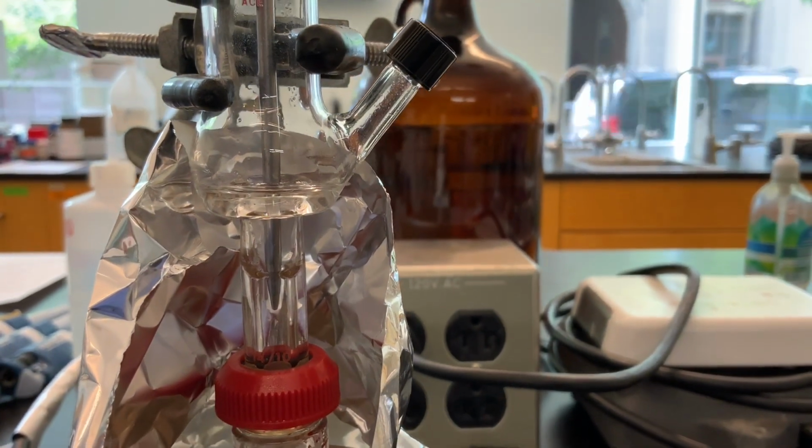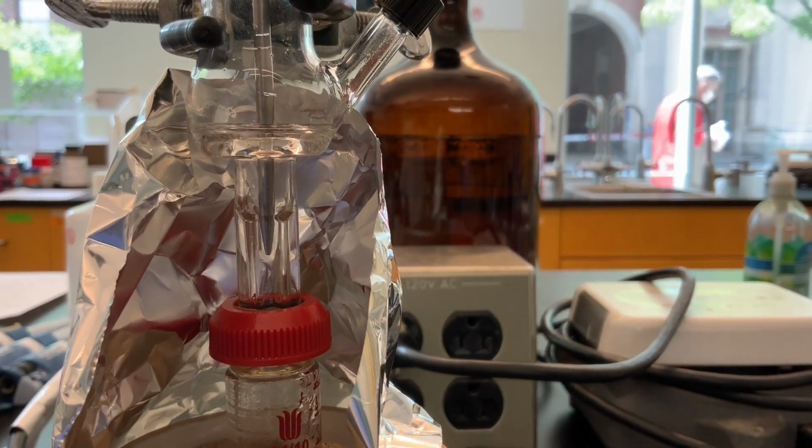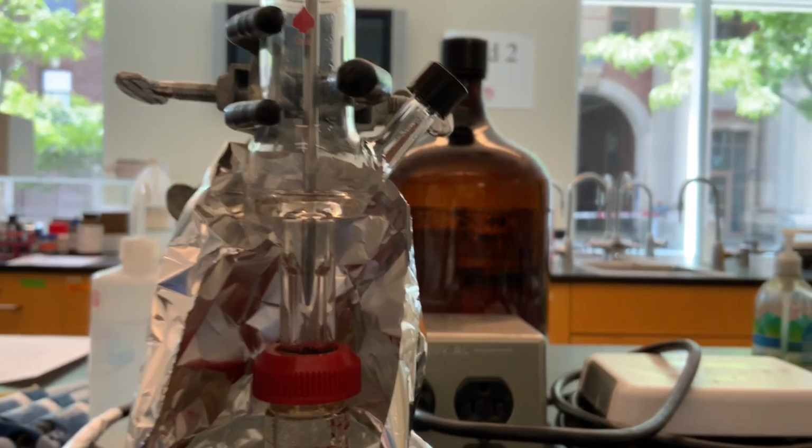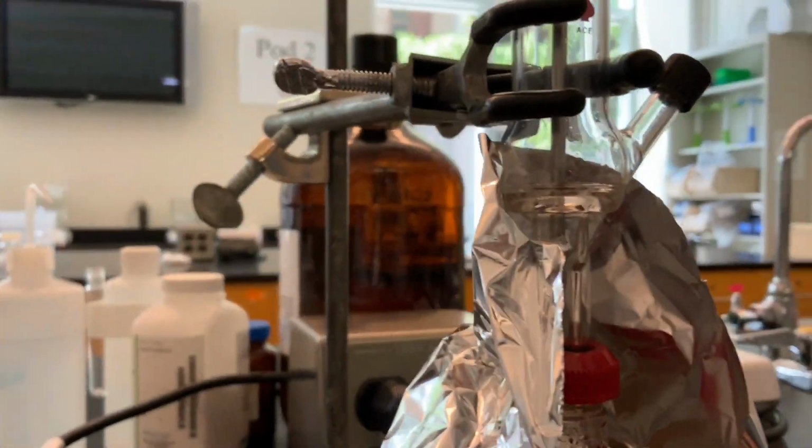Alright, so this is good enough. We don't need to distill to dryness. So this is going to be our fraction number 3. The maximum we saw was 110.1.